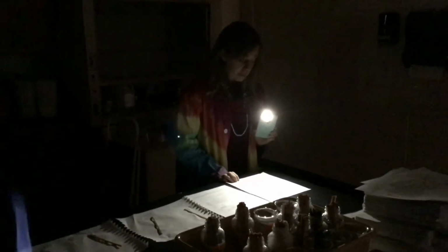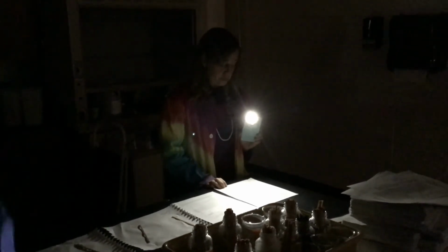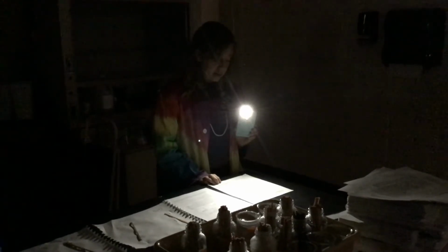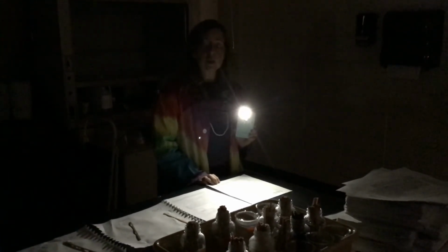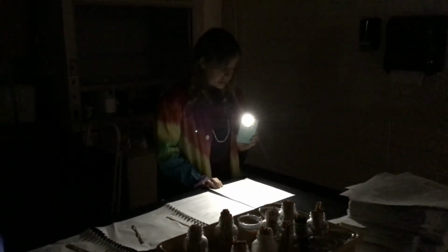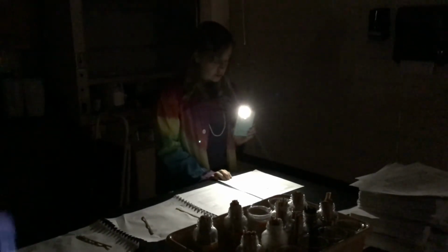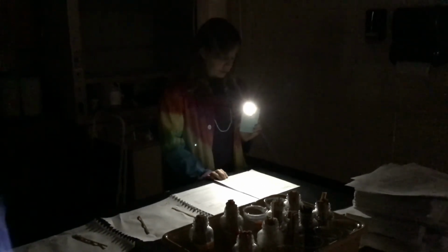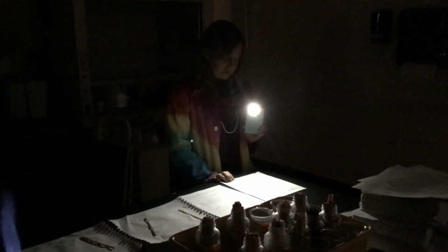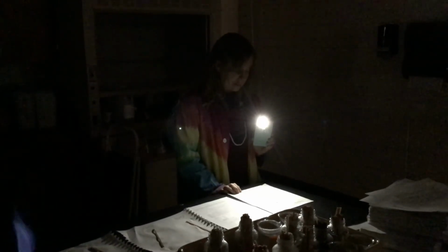The unique color that we observe during a flame test is actually a mixture of several different wavelengths of visible light. Chemists can use a spectroscope to identify these various wavelengths. We're going to use 3D glasses to do that. This technique is known as spectroscopy. A spectroscope splits light to form an emission line spectrum. The emission line spectrum for hydrogen is provided in the figure. The emission line spectrum for hydrogen consists of 4 different wavelengths of light.